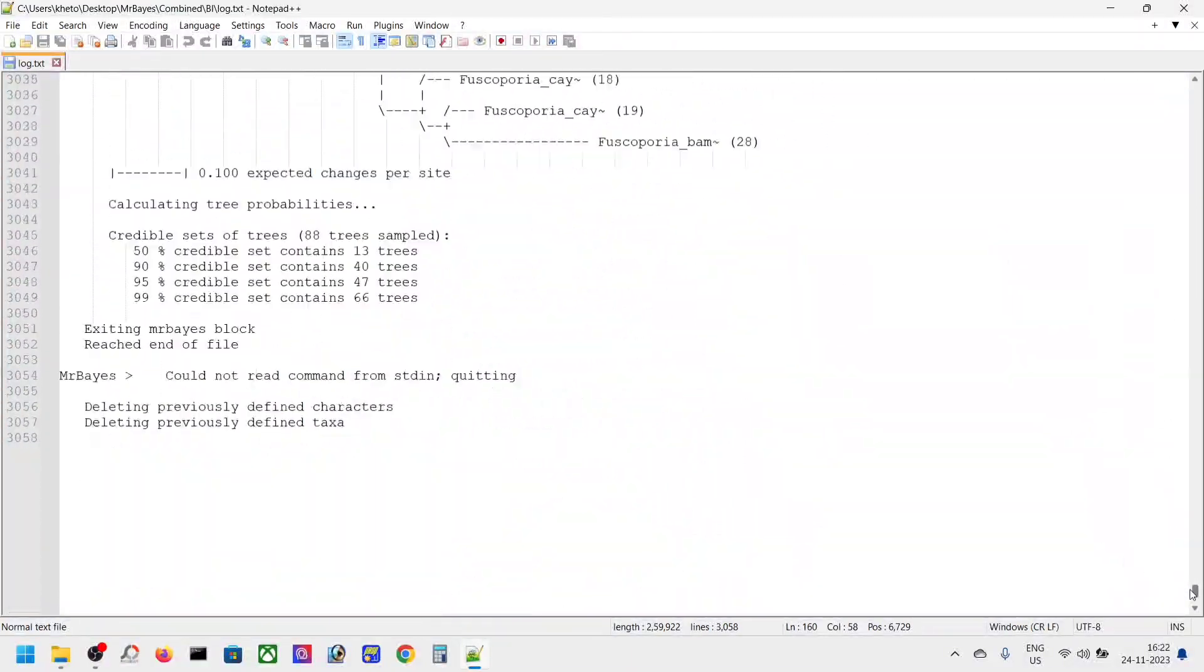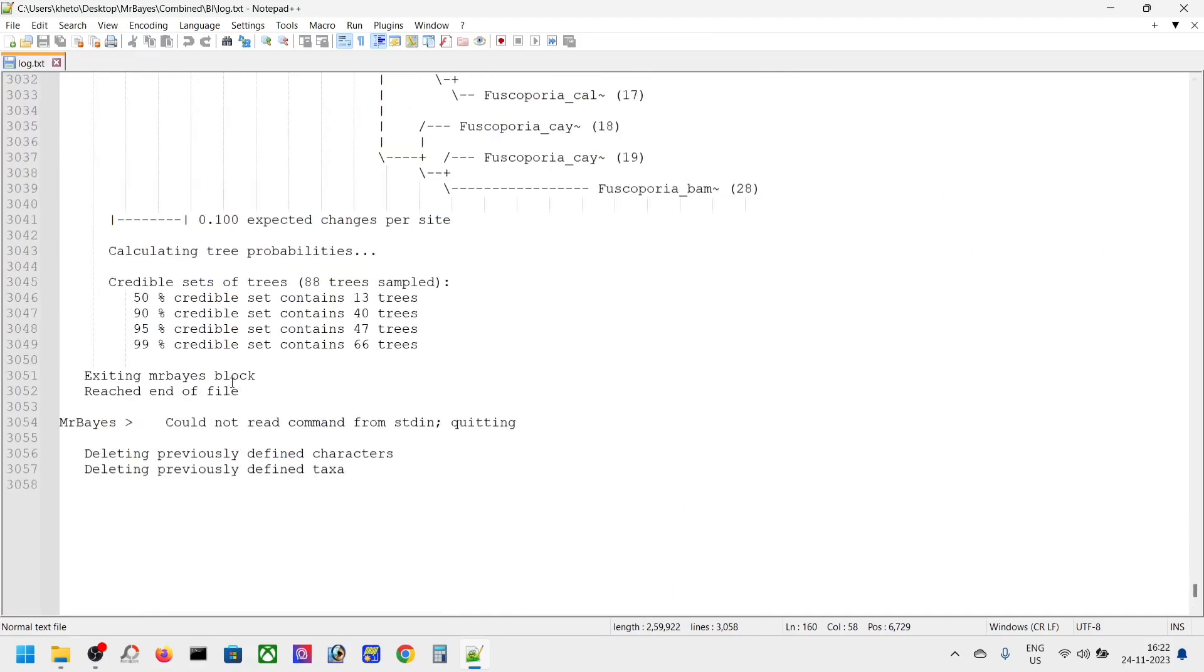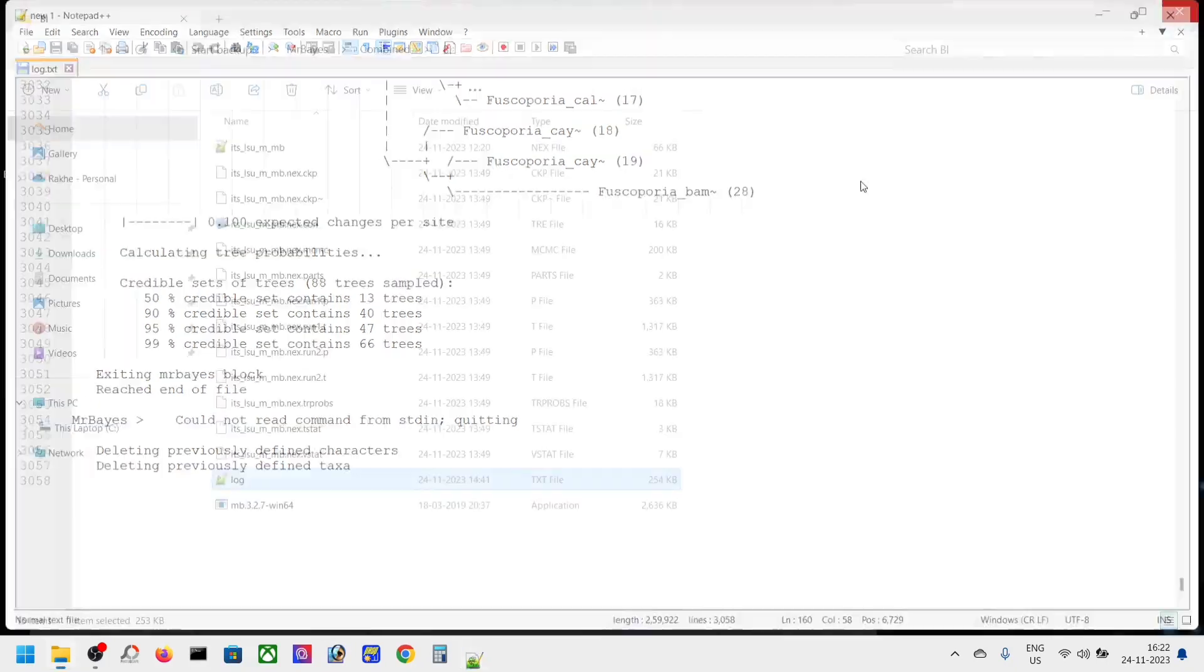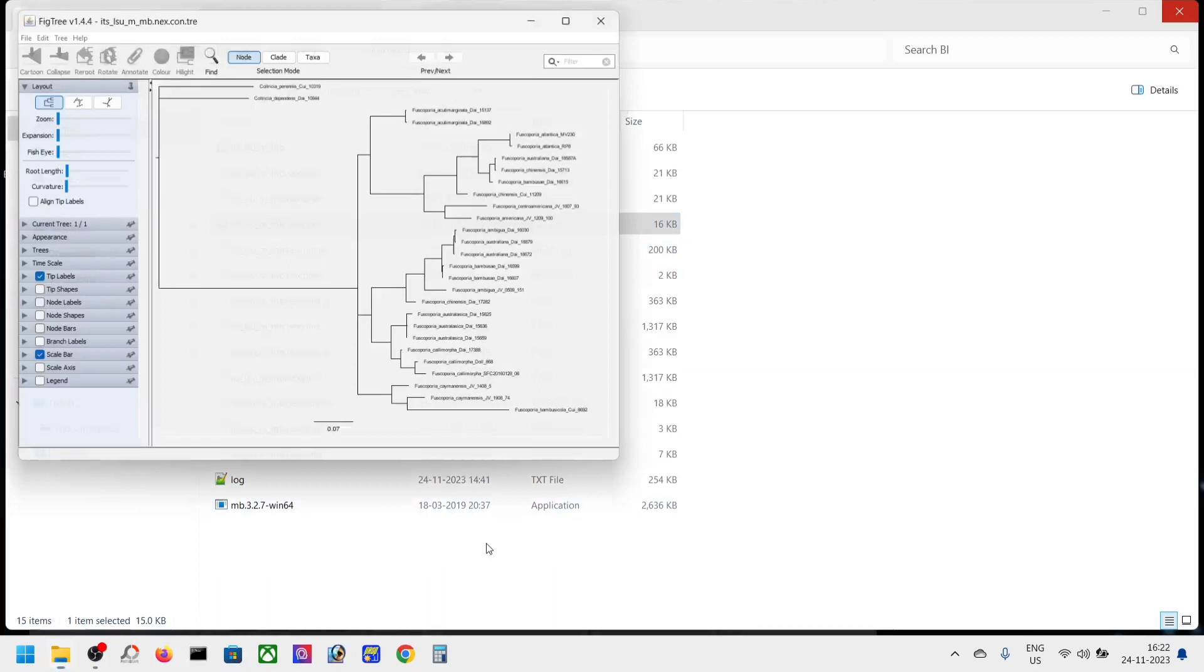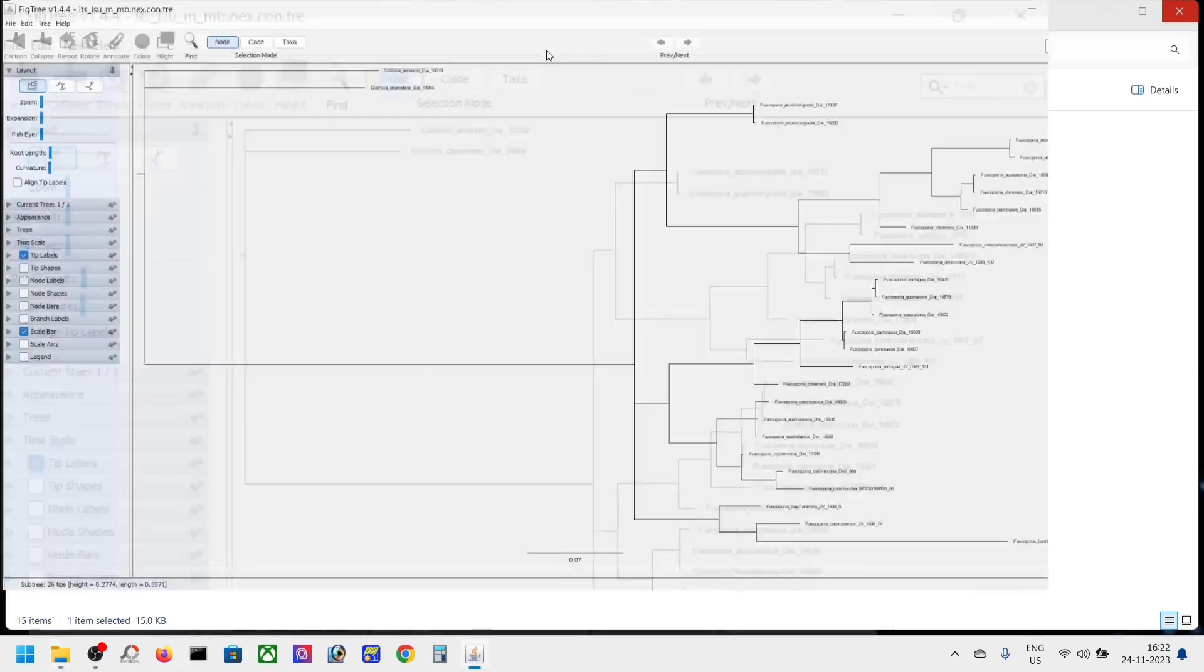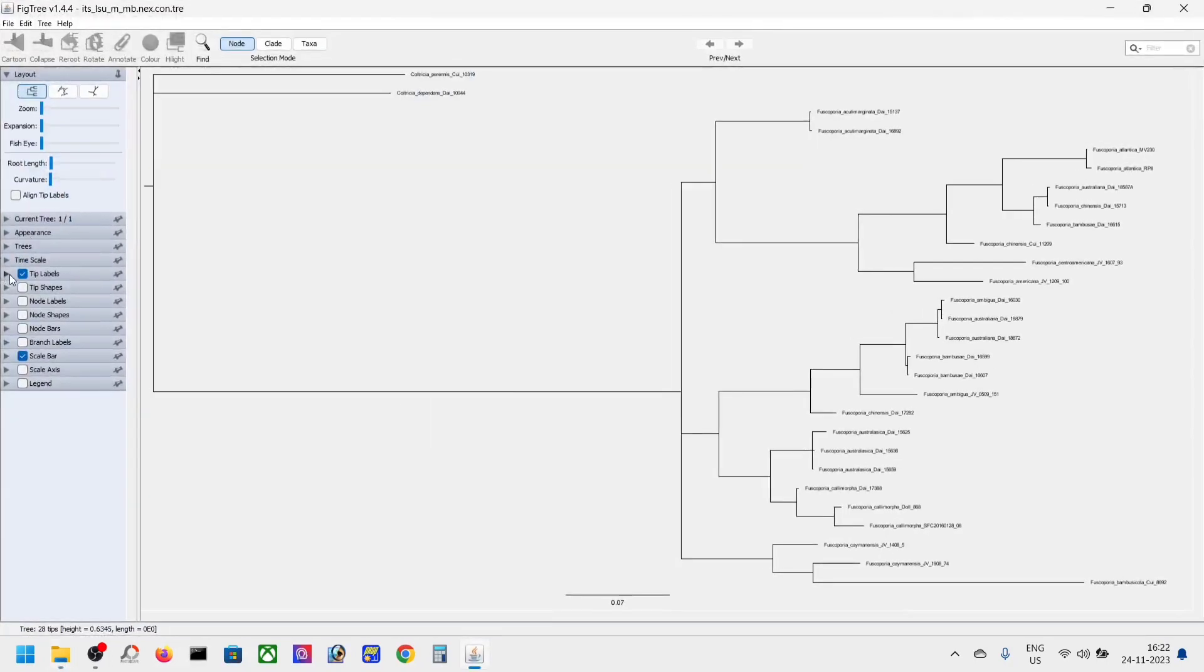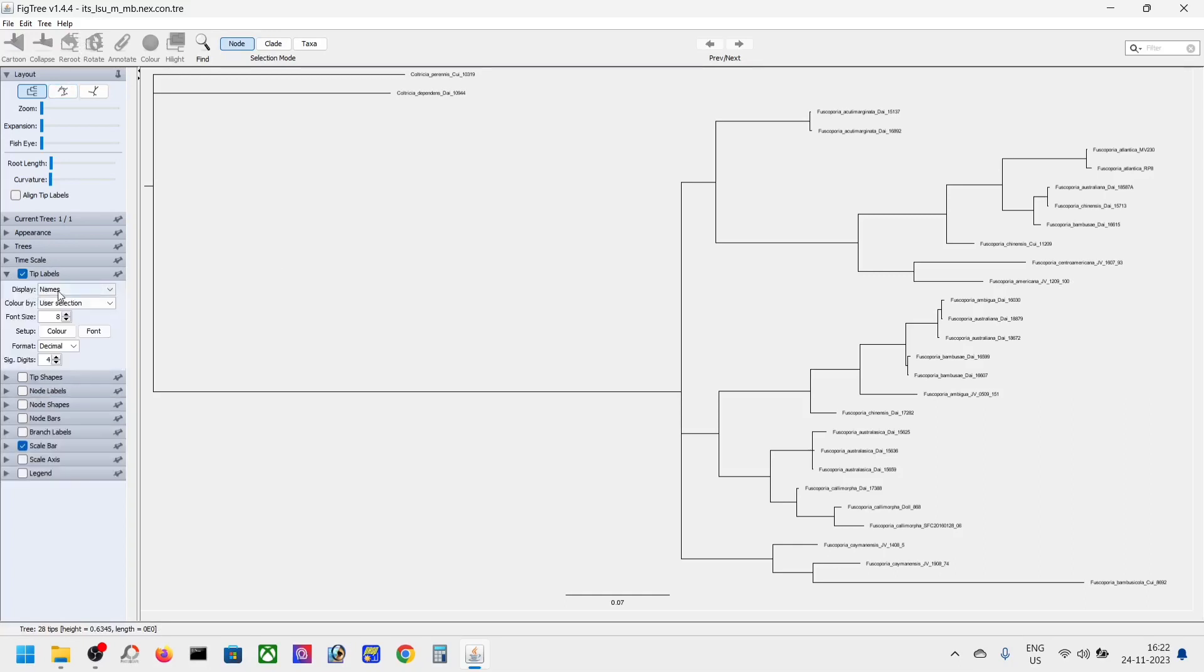After the analysis and closing MrBayes, you will find files like this. This is the tree file that we generated. You can see the tree here. This is the FigTree app—you can see my previous lesson for FigTree.